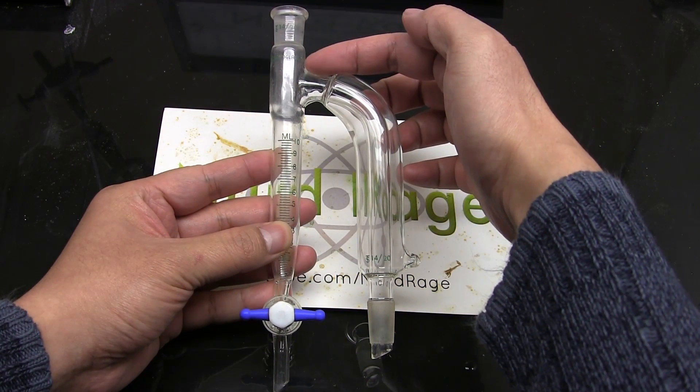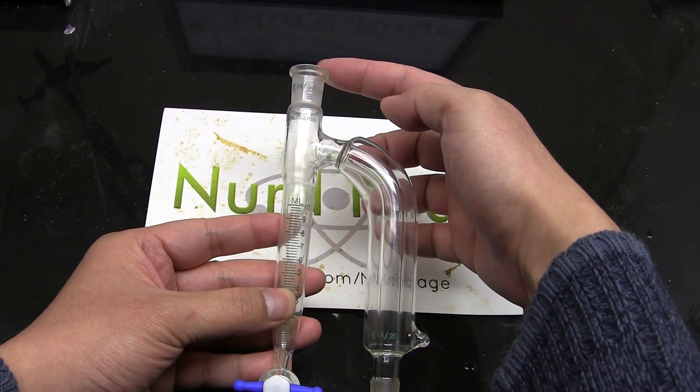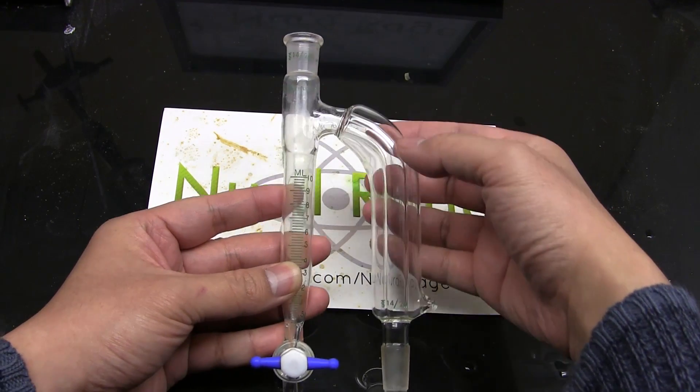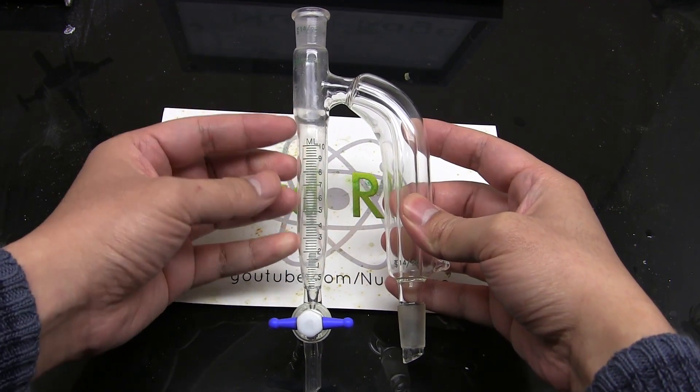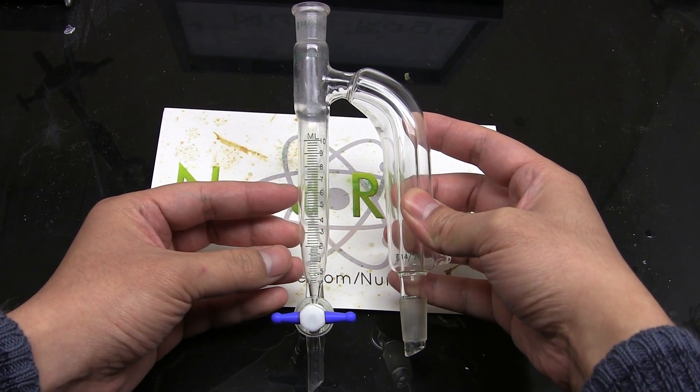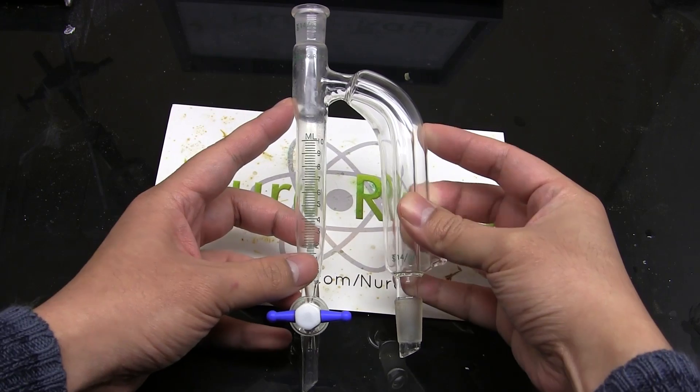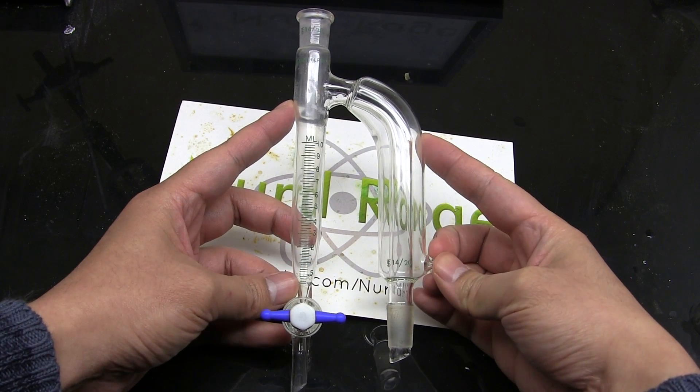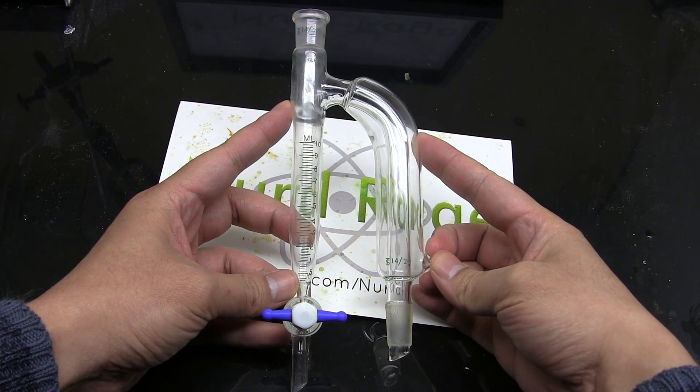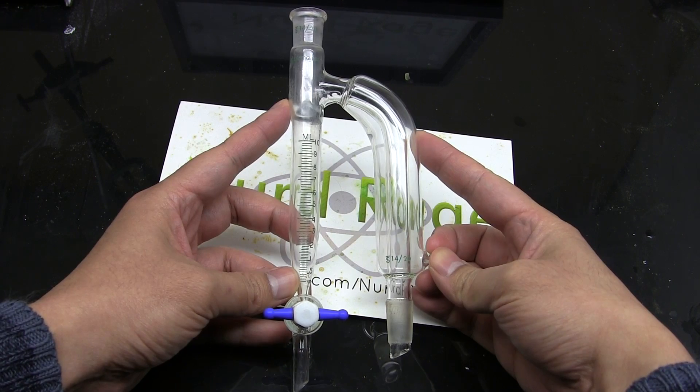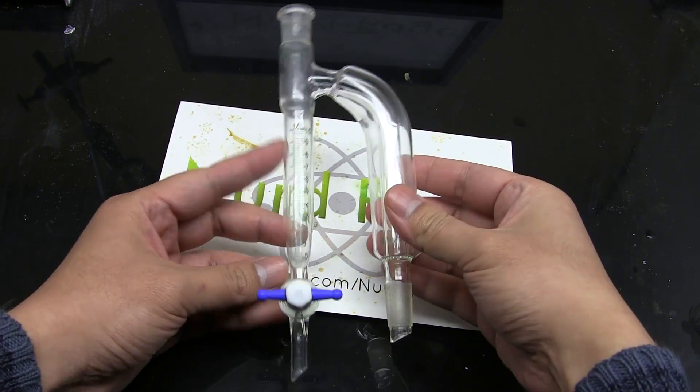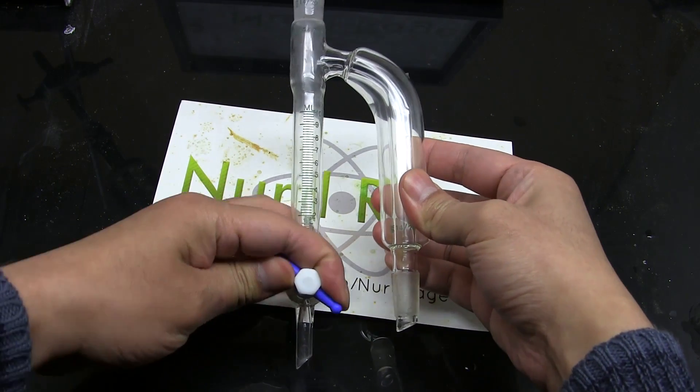Now how this works is that you attach this to the top of the boiling flask and as the vapors rise into the trap they condense on a condenser attached to the top. The liquid falls into the trap and the denser phase, usually water, accumulates in the bottom. The lighter phase fills up the trap and eventually overflows back into the boiling flask replenishing it, allowing more of these to show up to be boiled out. If too much of the heavy phase accumulates then it will also overflow back so it can be removed using this stopcock here.